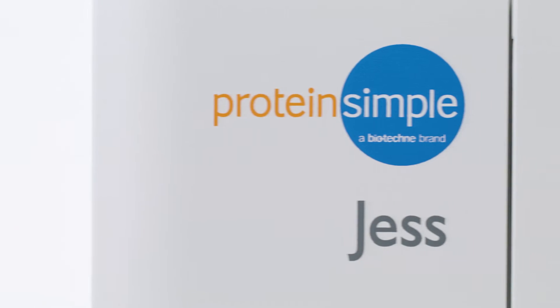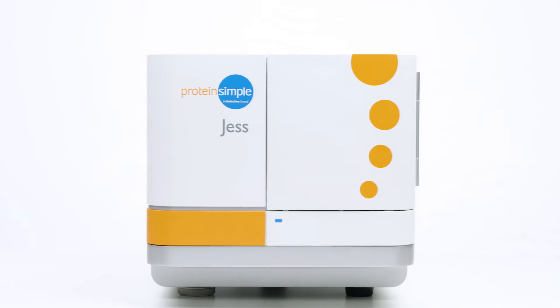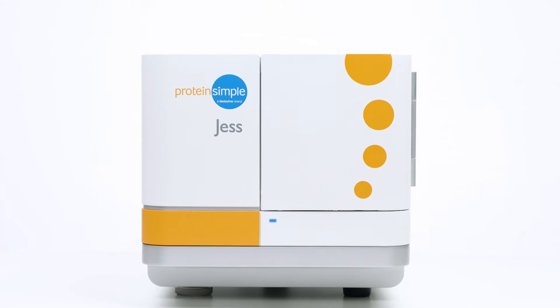Meet Jess, your protein analysis problem solver. Jess automates the protein separation and immunodetection of traditional Western blotting, eliminating many of the tedious error-prone steps.